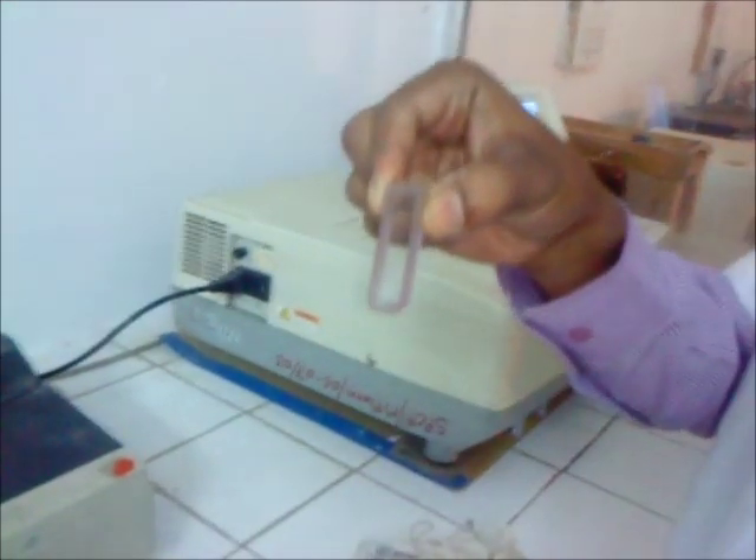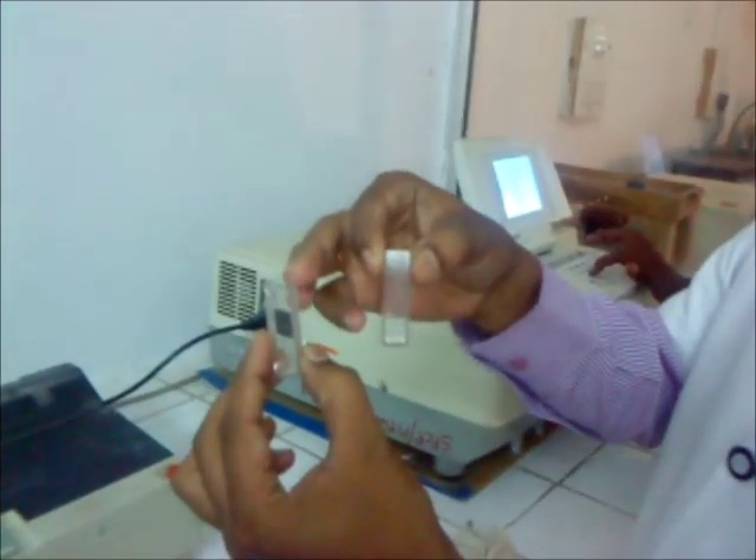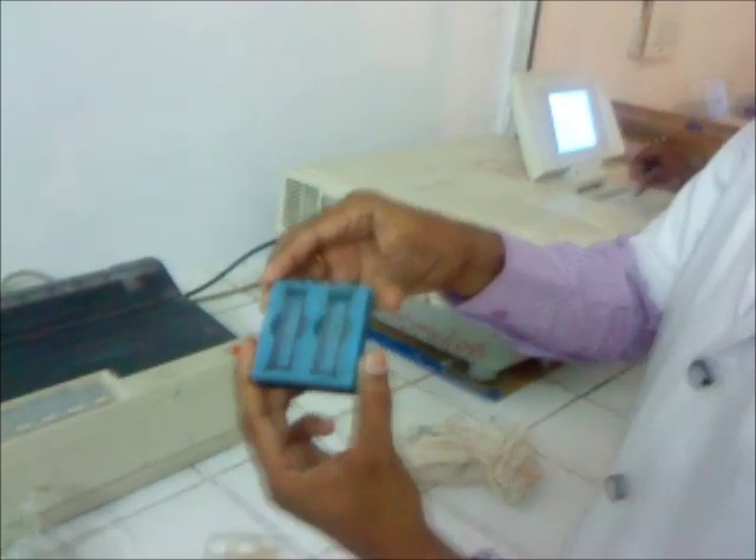These are the sampler holder — the A sampler holder and B sampler holder for the cuvette. These are the cuvettes, and this is the cuvette box in which cuvettes are placed.